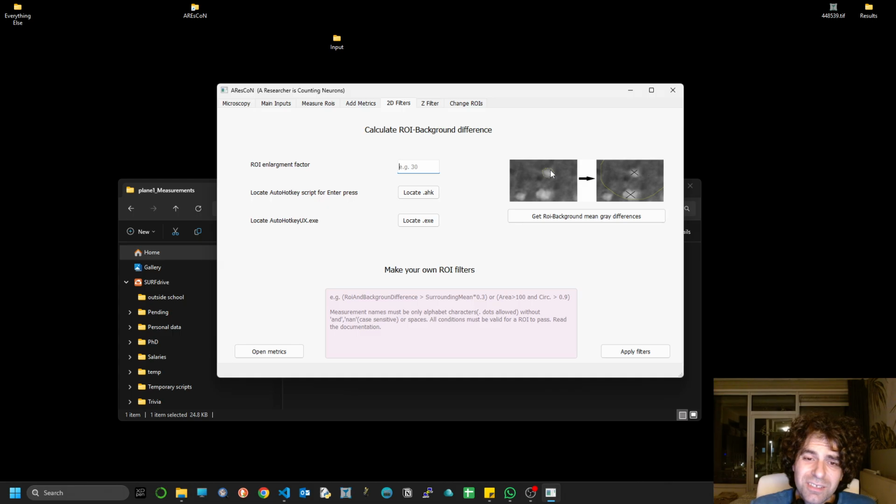This is a very crude way to go, and I used to go more or less that way in the past. I would take a mean measurement of the whole image, compare the difference between the mean value of the whole image and each single row, and filter in and out, and then manually intervene to rectify what was wrong.